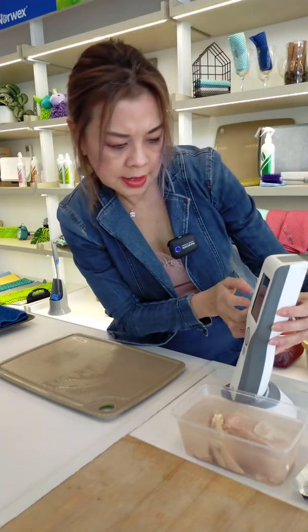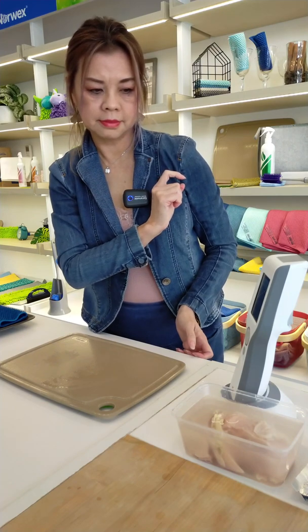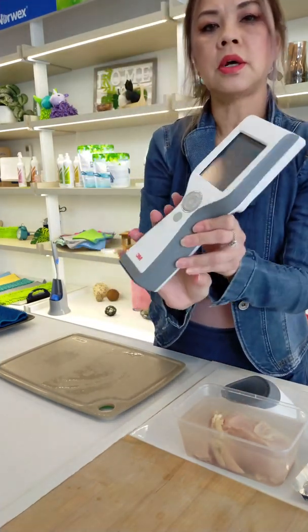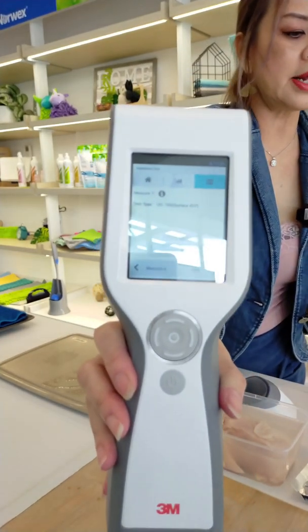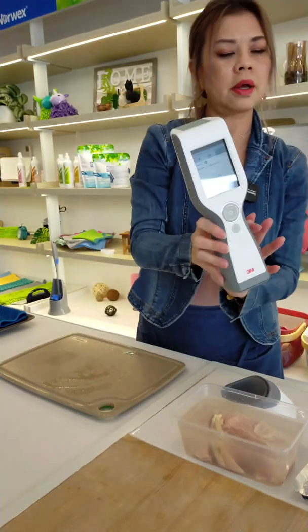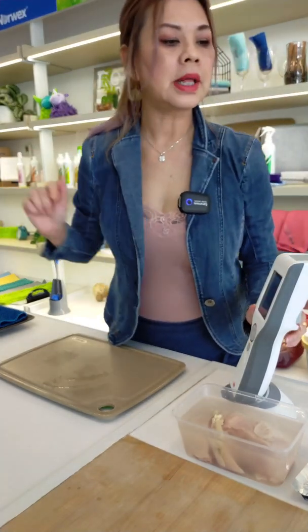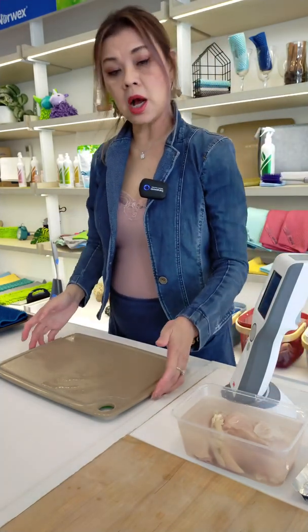There it goes, and let's start. It removed a lot. What's left now is 1,025 RLU against the 540,529 that was on the cutting board. That's a removal of 99.8% of the ATP from the surface.